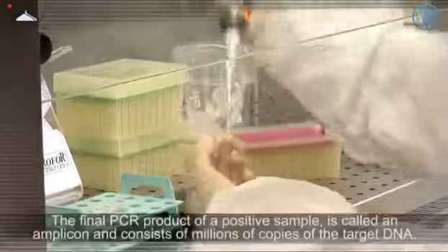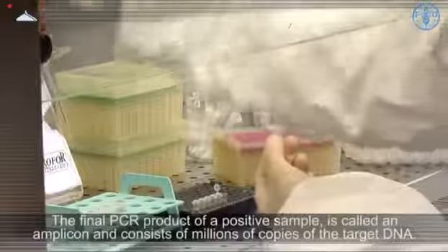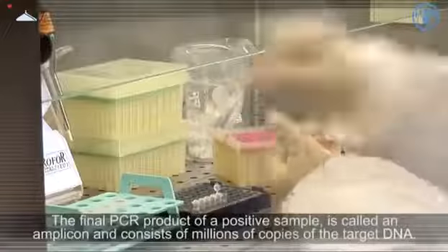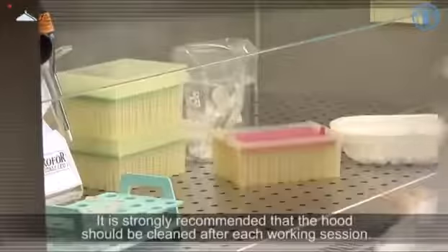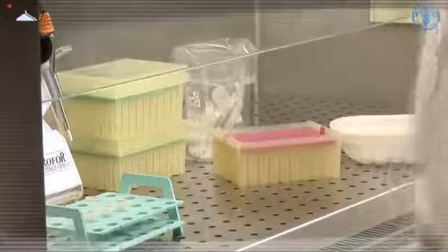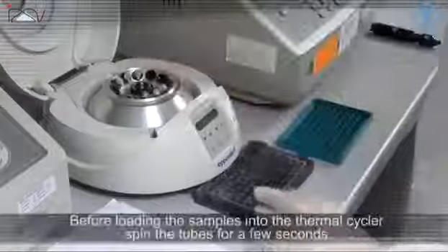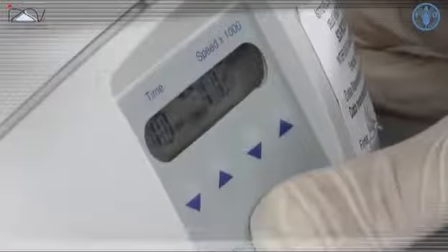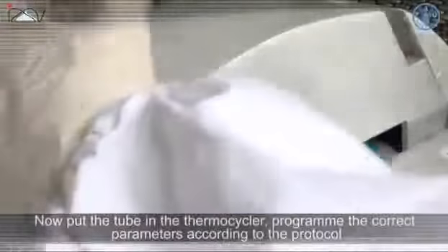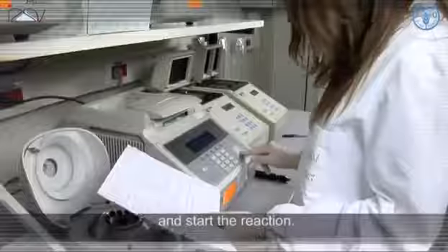The final PCR product of a positive sample is called an amplicon and consists of millions of copies of the target DNA. It is strongly recommended that the hood should be cleaned after each working session. Before loading the samples into the thermocycler, spin the tubes for a few seconds, then put the tubes in the thermocycler, program the correct parameters according to the protocol, and start the reaction.